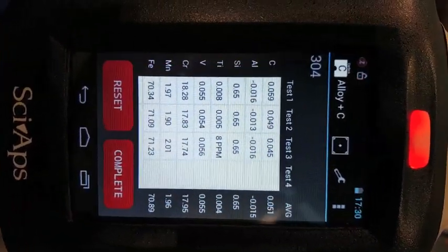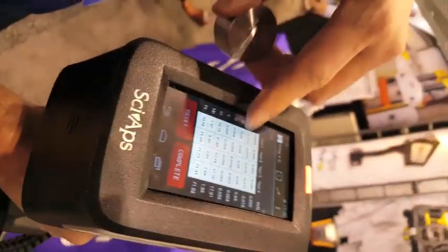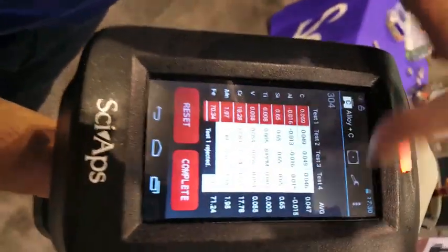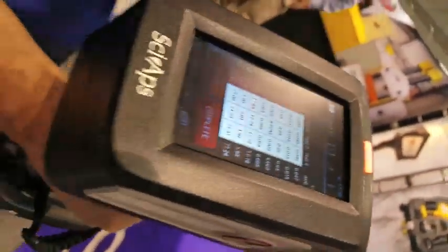Let's do one more — 046, beautiful. First burn may be a little high, tap it, get it out of the average. 047 — the cert is 049, so this is a very nice result. And there we go, that's our L-grade in action here at the show.